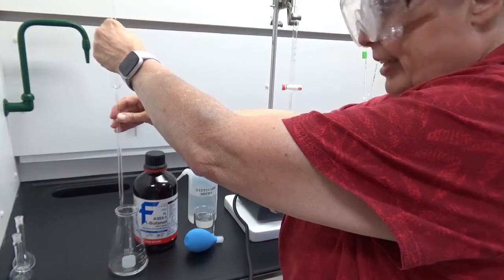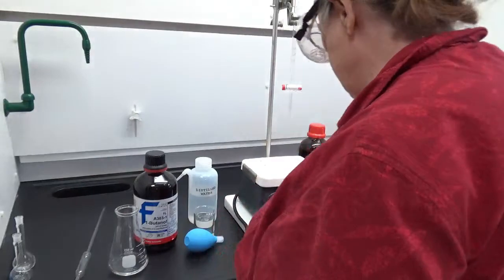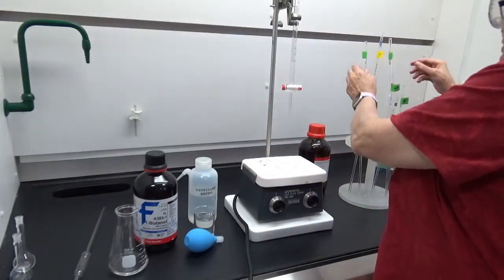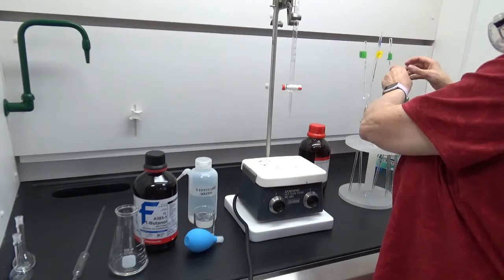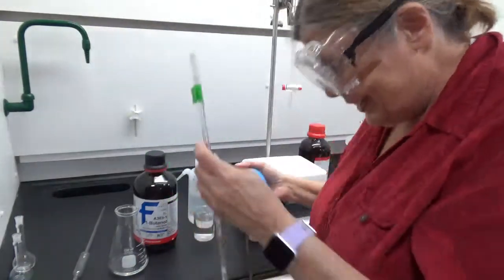If there's a drop hanging, you just leave it. Okay, that's the butanol. And now I'm going to pipette 5 milliliters of water. Let's see if I can find the right pipette. Here we go. They're all labeled.